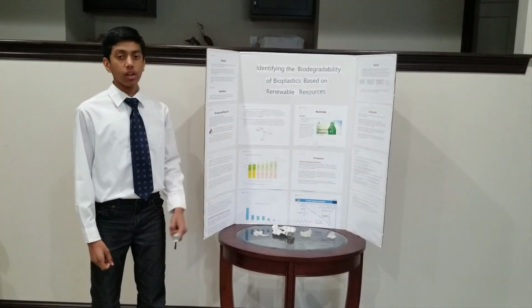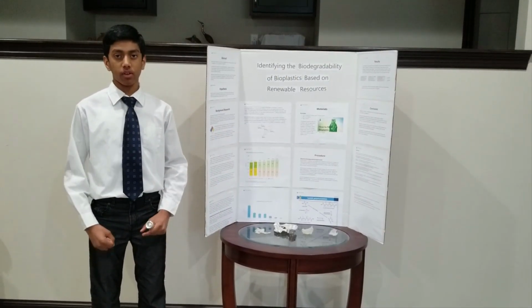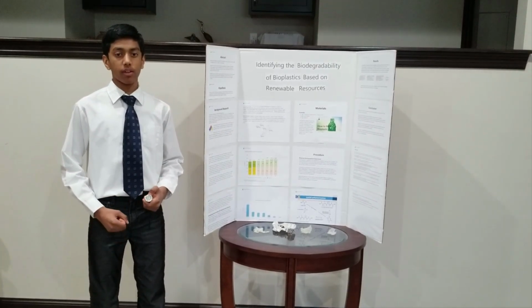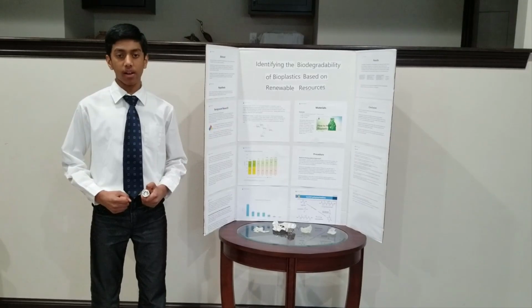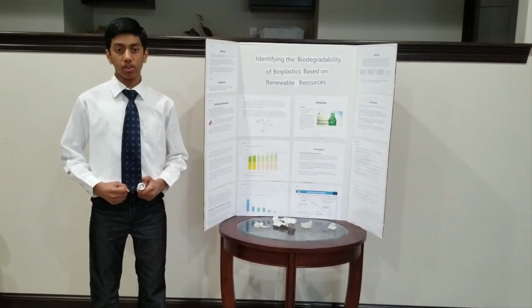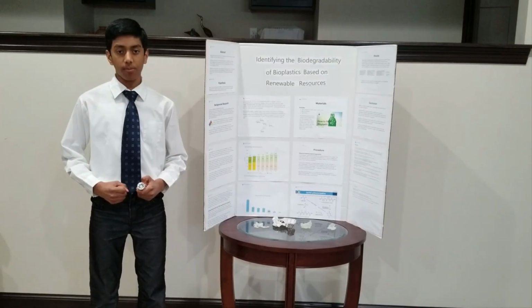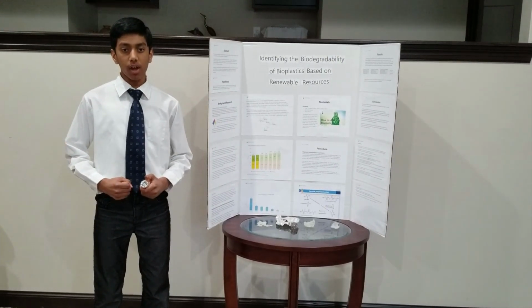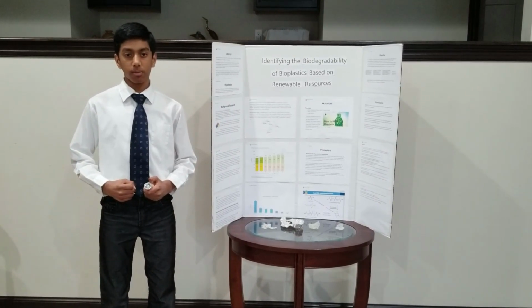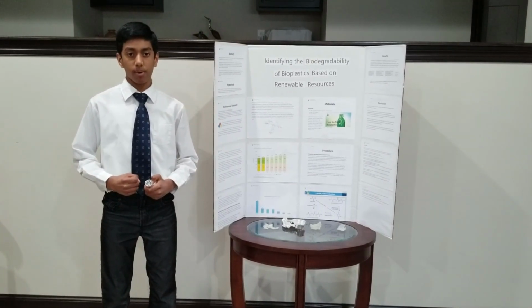Results. We conducted an experiment on the degradation of bioplastics using hydrolysis and amylase enzyme. Unfortunately, the experiment with the bioplastics and amylase enzyme failed and did not work as expected. A mix-up and confusion with the type of amylase enzyme occurred between the alpha and beta varieties. The current amylase enzyme did not seem to visibly biodegrade the bioplastics.